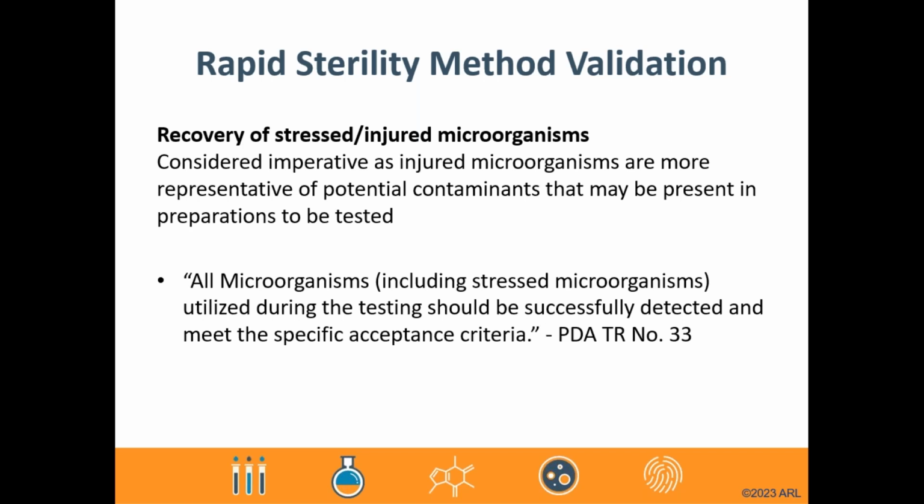In order to perform this testing, methods are often used to stress or injure different test colonies or cultures. Some of those methods are to expose microorganisms to certain environmental conditions, such as UV, heat, cold, pH adjustments, or to certain antimicrobial conditions, so exposing them to disinfectants, or to put them through certain sublethal sterilization conditions. Either concurrently or prior to testing, these stressed microorganism cultures should be plated and enumerated to ensure that the appropriate reduction in viability is seen. The expectation is that reduced CFUs would be present in the injured group compared to the control or healthy cultures being used.